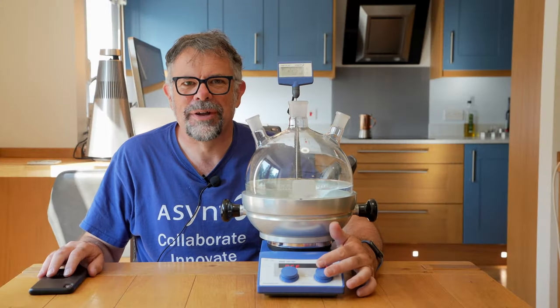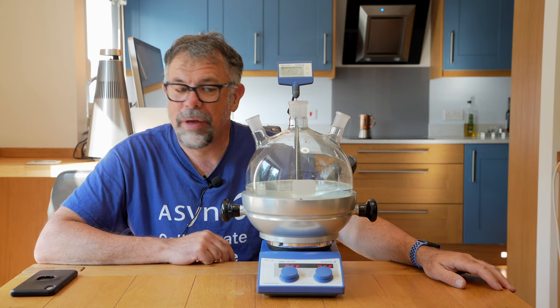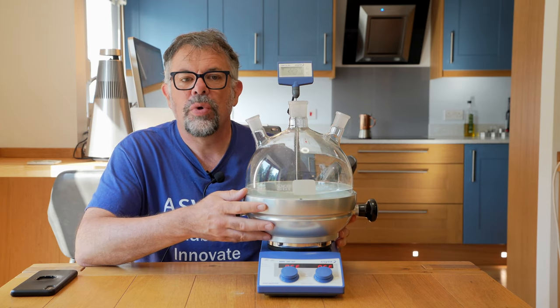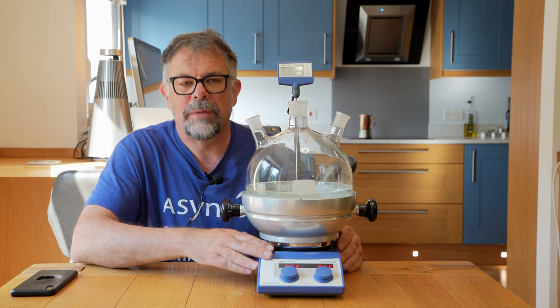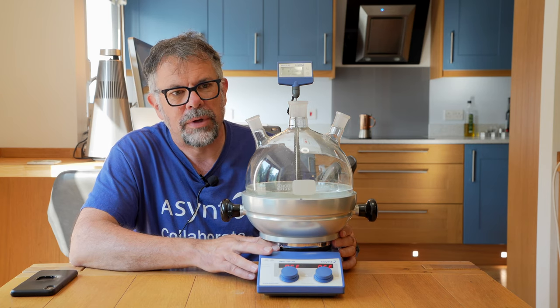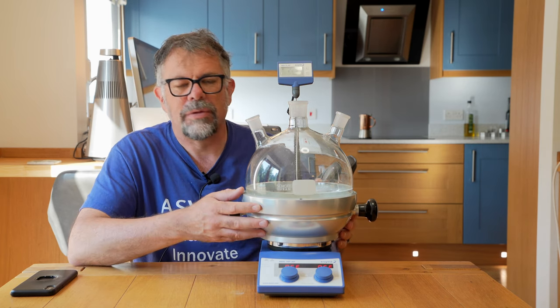Let's turn off the stirring. Some things to bear in mind with such a large Driesen is that your heating performance is going to be limited by the power of the hot plate stirrer. A more powerful hot plate stirrer heating element will get to a higher temperature.